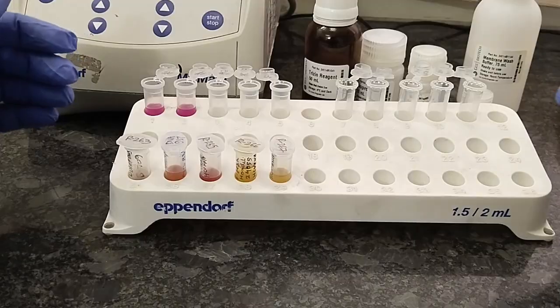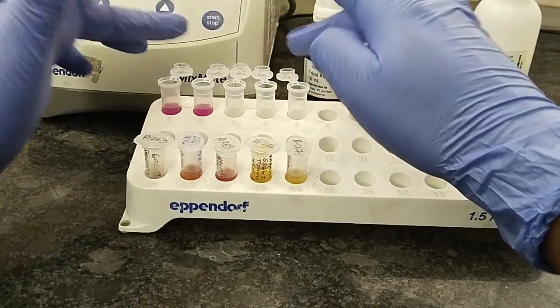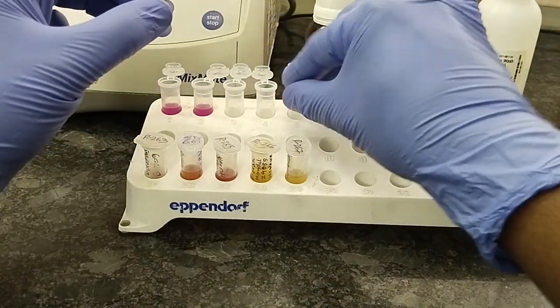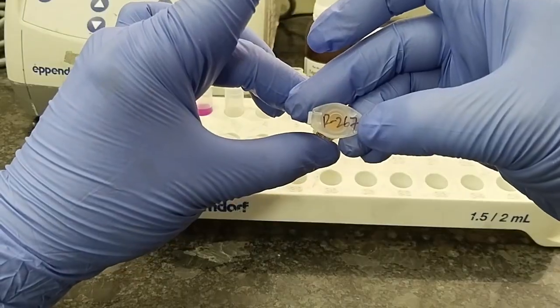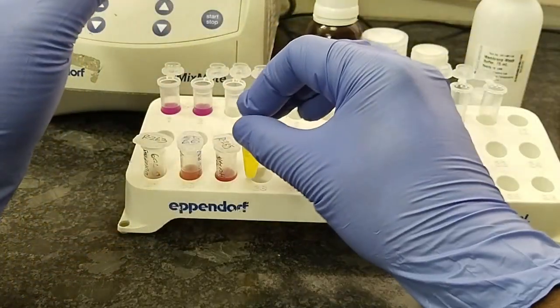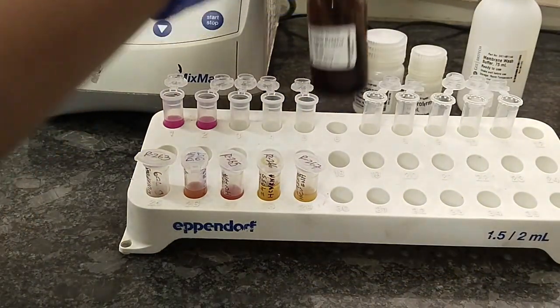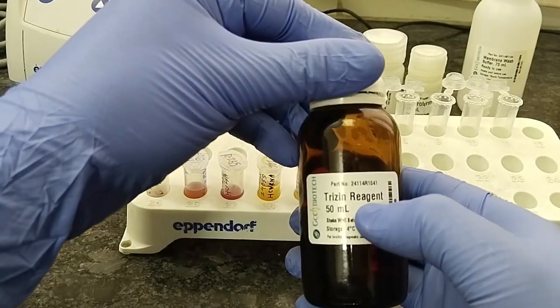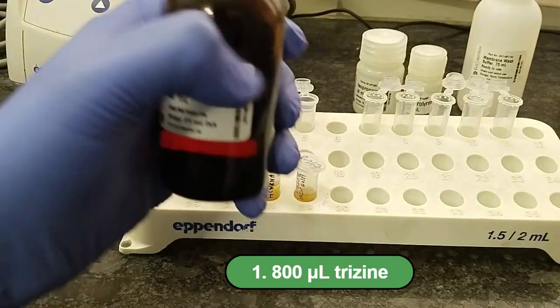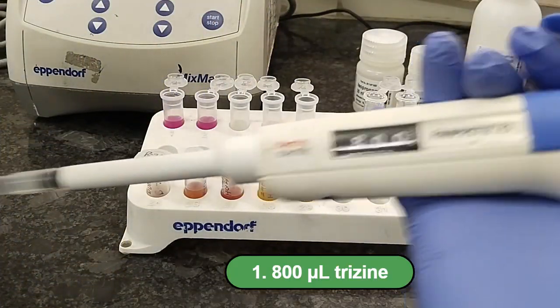Let's get started. First, I have taken 5 tubes for 5 samples, and I have given each a specific number. You can see from here, every sample contains a specific number. So first of all, we have to add 800 microliter TRIzin reagent. So let me add 800 microliter TRIzin reagent.